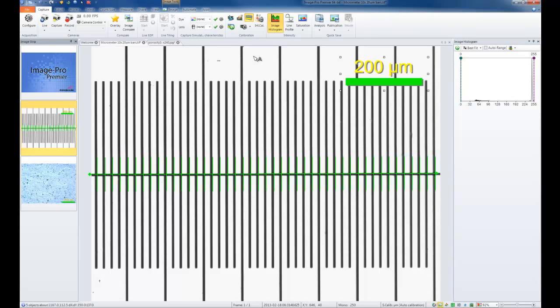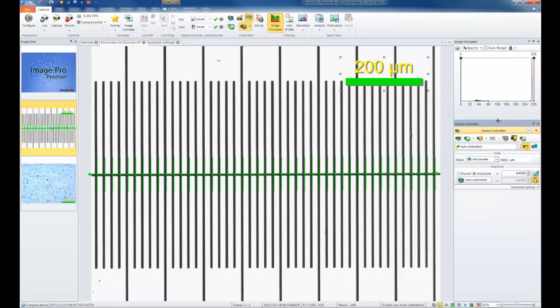To see where my calibration has been placed, I can always go to the spatial calibration options. In this drop-down, my first option opens a dialog which gives me many different options to choose from. In here, we see all the calibrations that have been created as reference calibrations. Small icons denote the type of calibrations that have been created as well. The star shows all my reference calibrations, and the globe shows my system calibration, the one that will be applied when I capture with the camera.